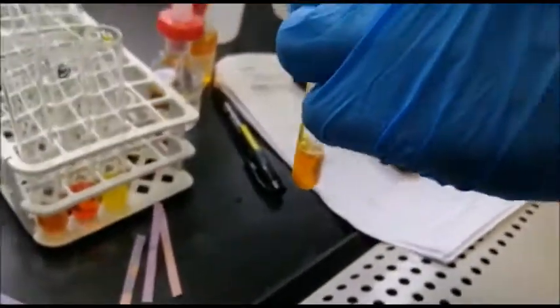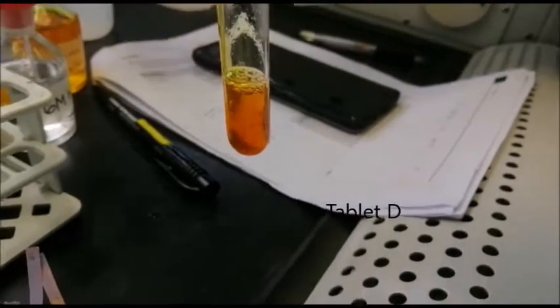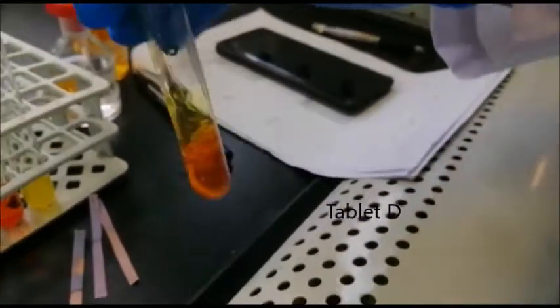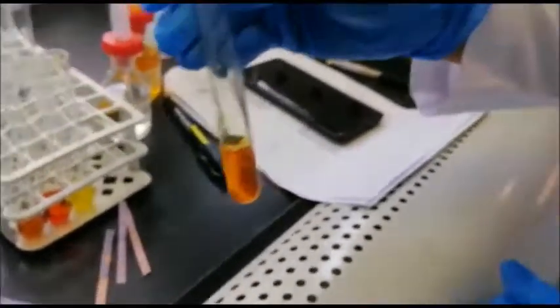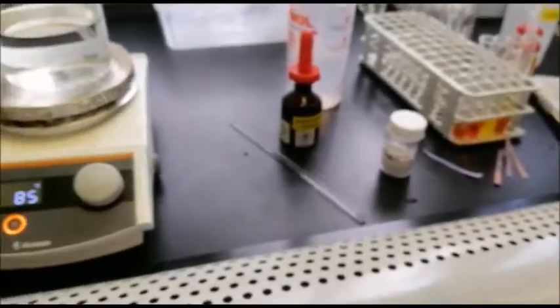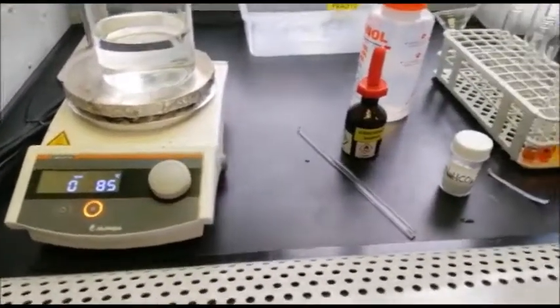In addition, tablet D achieved a yellow-brown color and not the usual red as for alcohols subjected to this reaction. After adding a bit more ceric ammonium nitrate, there is a hint of red color developed. This is because ceric ammonium nitrate is a strong oxidizing agent that is able to oxidize the tertiary alcohol in tablet D and hence achieving a brown color.